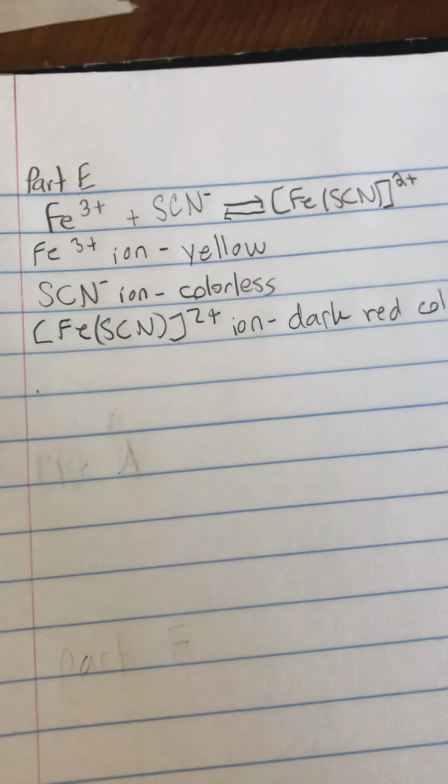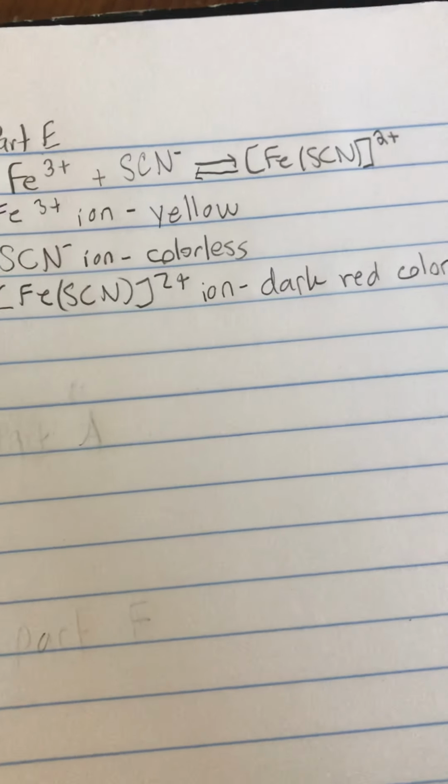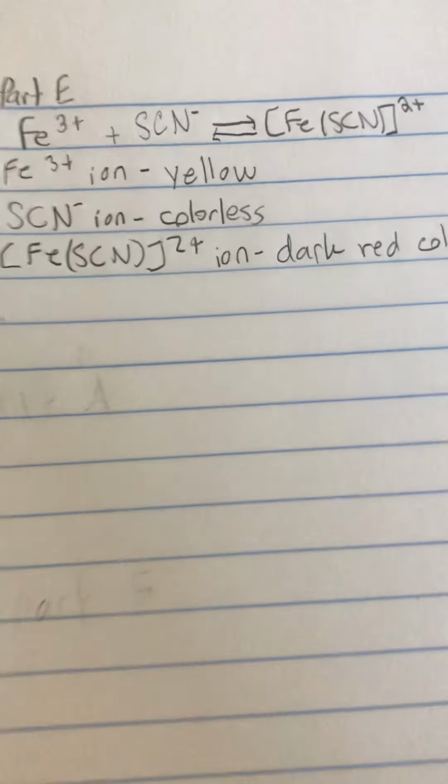The next question says, explain the color change that occurred when KSCN and FeNO3 were mixed.